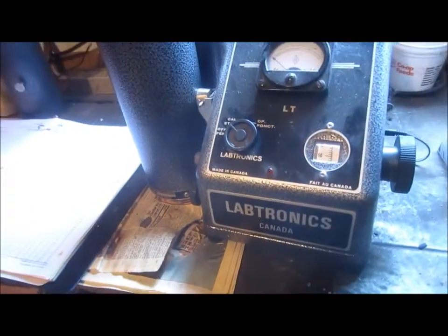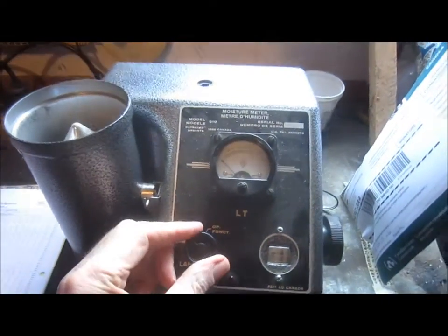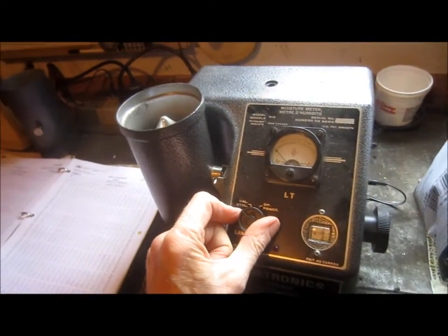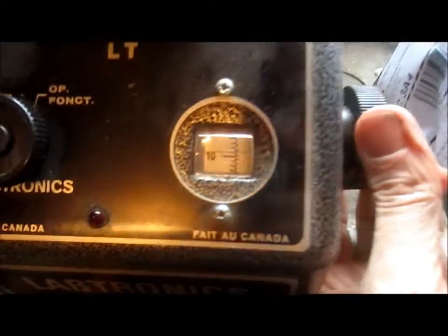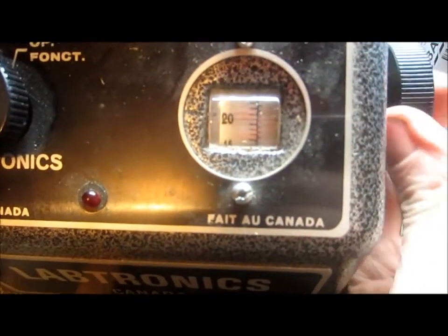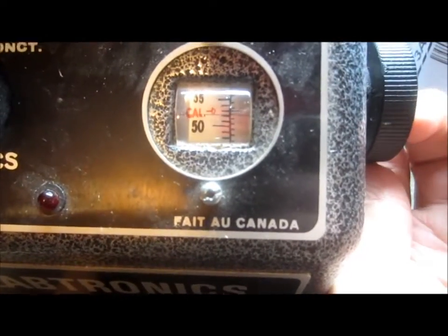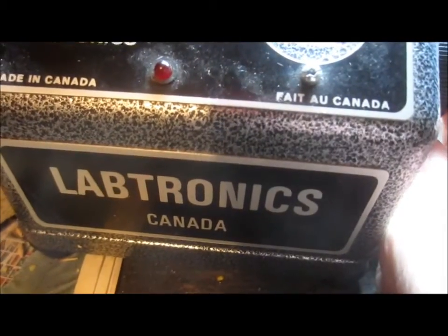Before we can do a real test, it's pretty important to calibrate your tester. This is the popular Labtronics 919 moisture tester, as found in most grain buying facilities. First thing, make sure it's plugged in, then set the knob up to number 50.